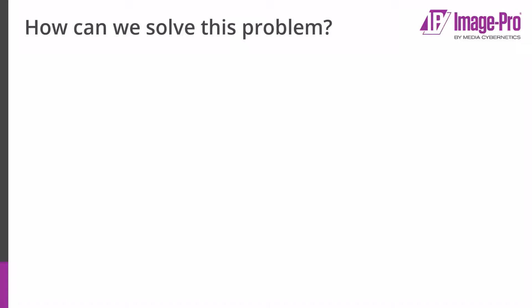So how do we solve this problem? There have been two main approaches to solve this. One is with optical solutions, such as the laser scanning confocal microscope, in which optics are used to prevent photons from out of focus planes reaching the detector. The second method has been mathematical solutions, mainly deconvolution. There's another third option, which is a combination of optics and mathematics, but these aren't very common.